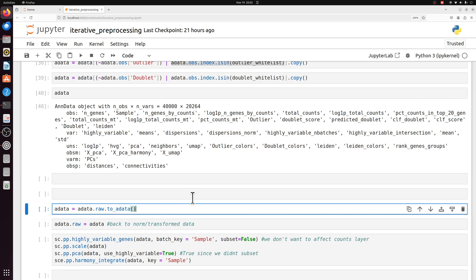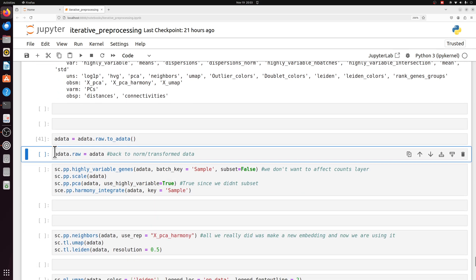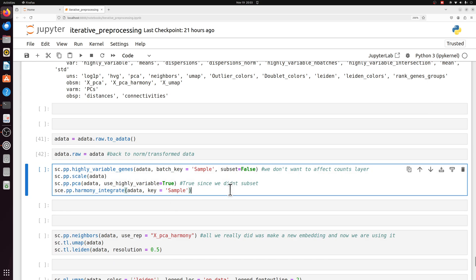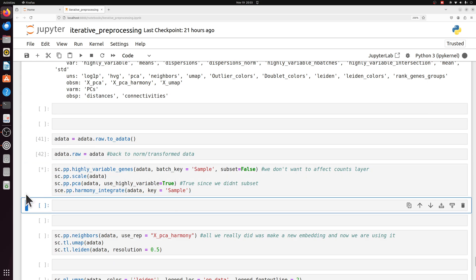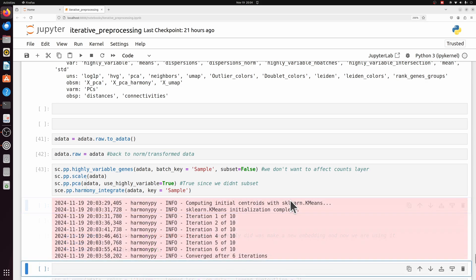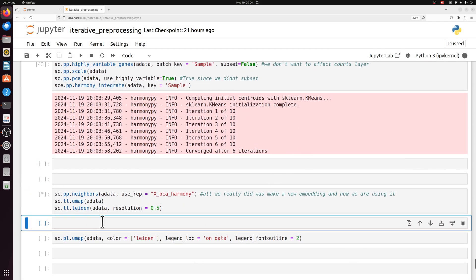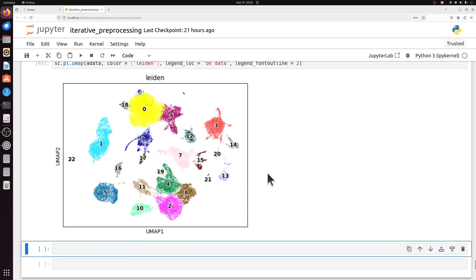And then since we already did the integration and dimension reduction and clustering on the data that contained these outliers and doublets, we're going to reset it to the raw. We're going to resave the raw just because you need that downstream for a lot of things. And then we're going to do the integration again. All right. So we have our integrated data and we're going to use that embedding again for the neighbors, UMAP, and Leiden. And then we have our final data. If we didn't do this, we would have thrown away at least three actual biological cell populations. You should always do this because it really doesn't add that much time. You've already annotated all the cells at this point. All you really did was annotate a couple extra populations that might have been doublets or outliers.